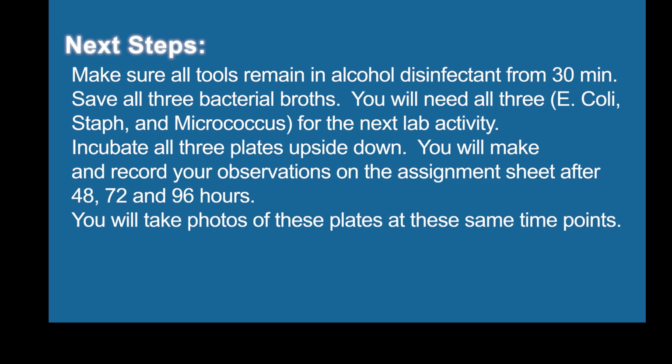And then these plates need to incubate, like all of our plates, upside down. And you're going to be observing these plates after 2 days, so 48 hours, again at 72 hours, and then a third time at 96 hours. At each of these time points, what you want to do is make and record your observations in the assignment sheet. So there's a data table where you're supposed to be looking for different results. And then, of course, taking photos at each of these time points as well to demonstrate that you've completed this lab activity appropriately.